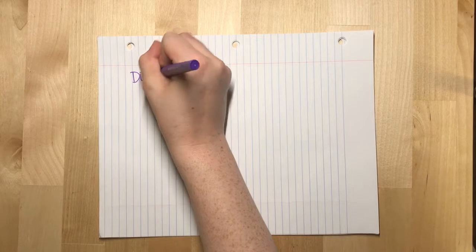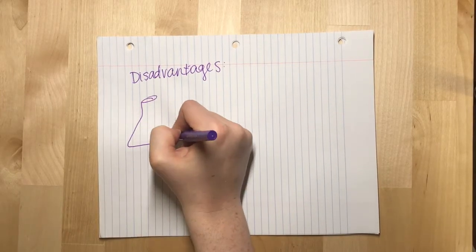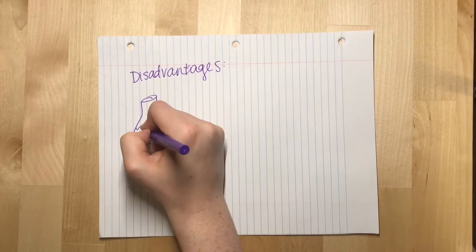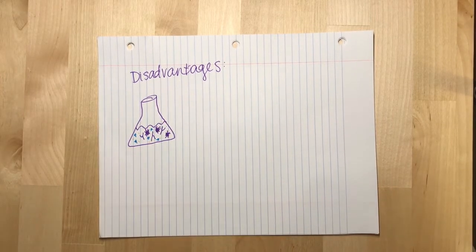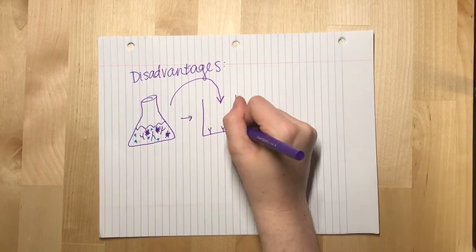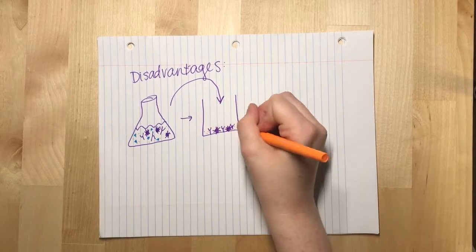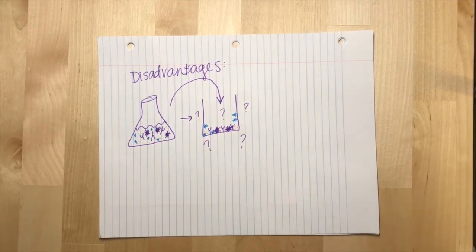Where there are advantages, there are also disadvantages. In your sample, you'll have antigens, antibodies, proteins, and many other substances along with your antigen. Any molecule from your sample could bind to the bottom of the plate, creating competition for space. At this point, the instrument might not even pick up your specific sample.